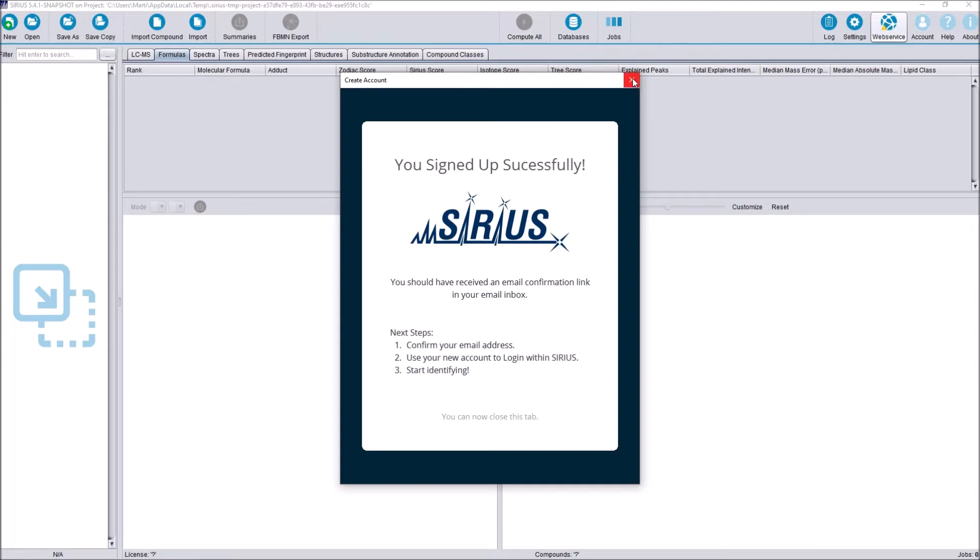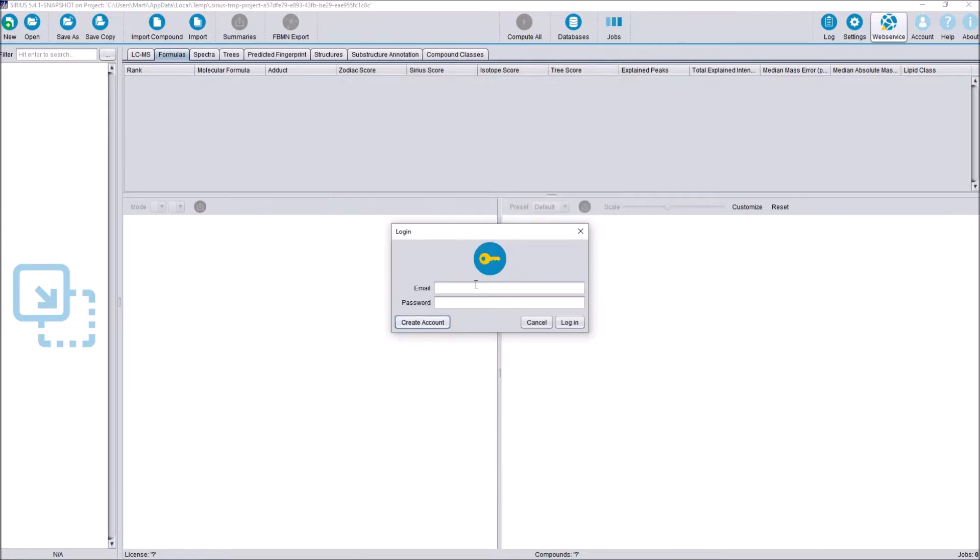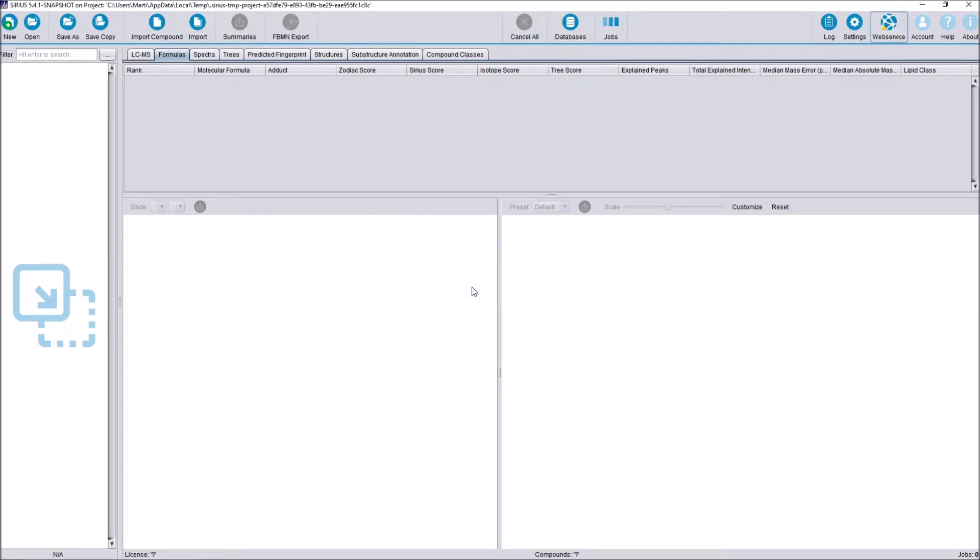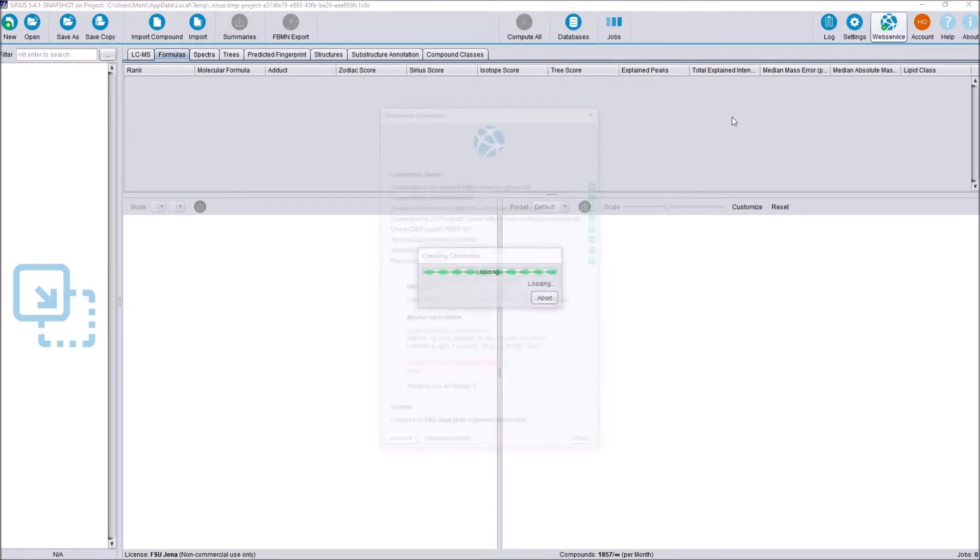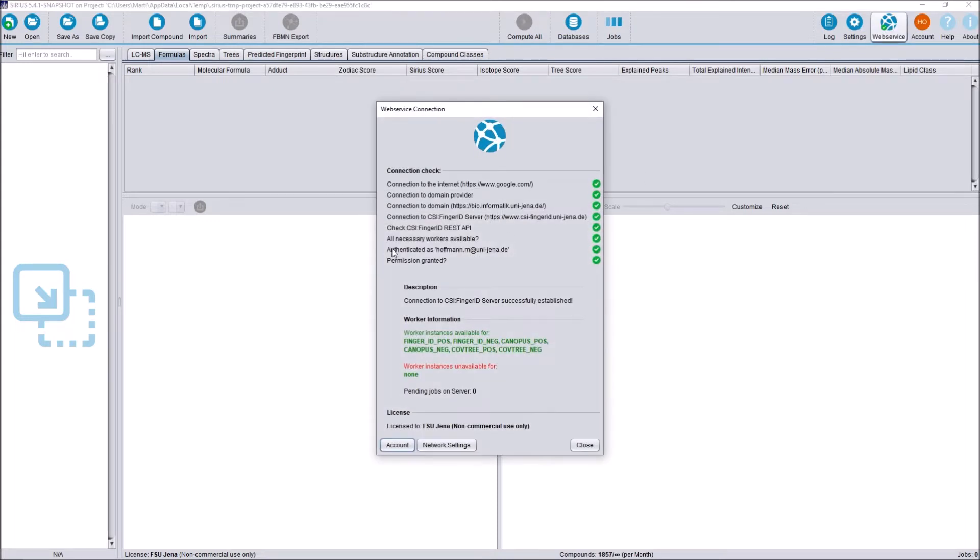We can then close this tab here and we can use our newly created account to log in. In my case, I will be using my personal account and then after entering the password, we are logged in. We can now go to the web service tab here on the top right again to check if our authentication worked, if all permissions are granted and also to see what license we are currently working under.